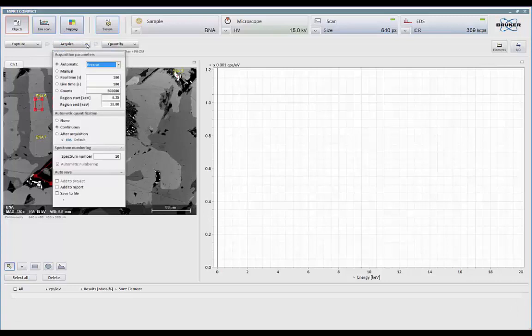Here's all the conditions for which I can collect spectrum. So we can do it based on precision, basically 1, 2, 3 sigma. So irregardless what the count rate is, it assures you you have minimum statistics.